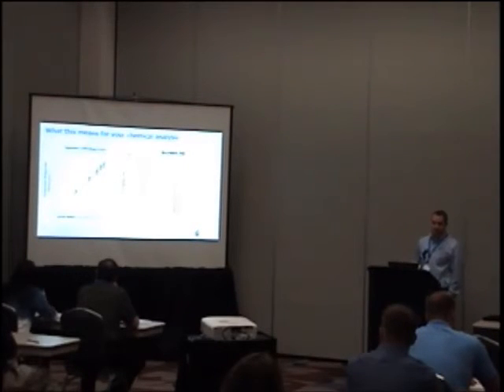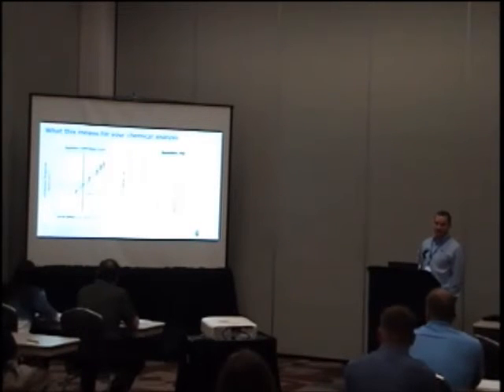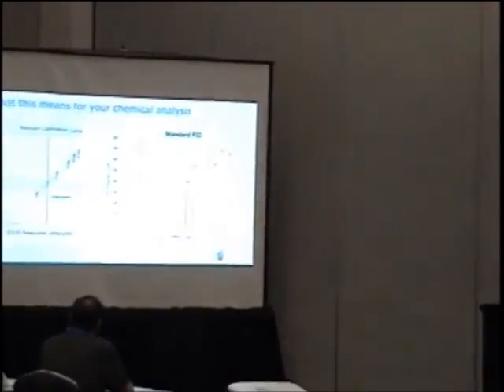We can repeat this for all 9 of the other components. Again, there's one internal standard. And we can create calibration curves for all of these components. Again, an arduous task. And now I can put an unknown sample there with an unknown composition, and I can read off the concentration from these calibration curves, and I can look at what the error was because I'm actually using a known in this case. We're just treating it like an unknown.